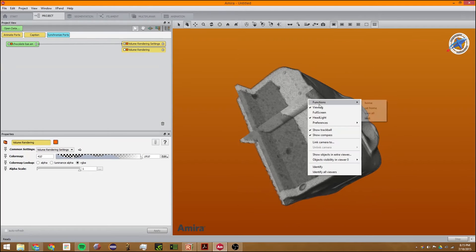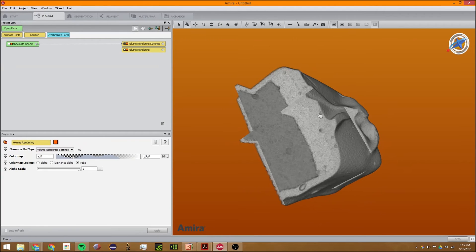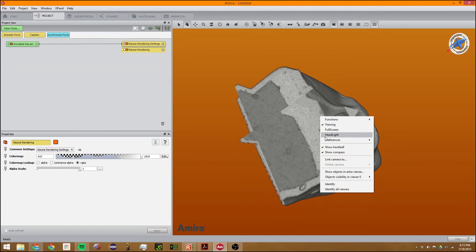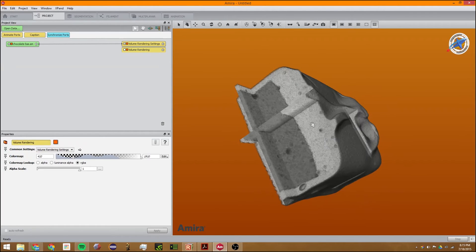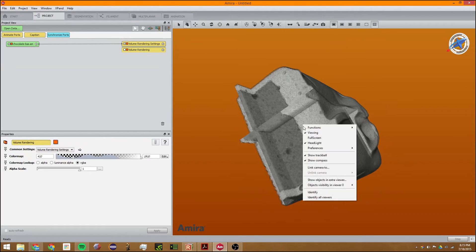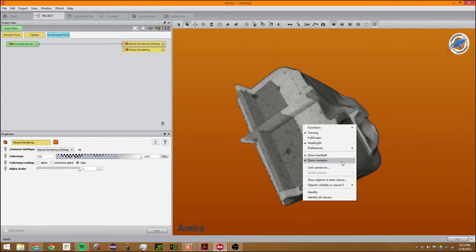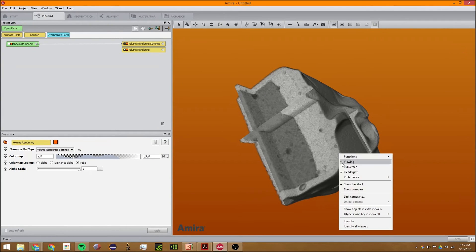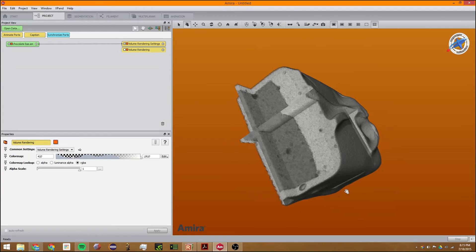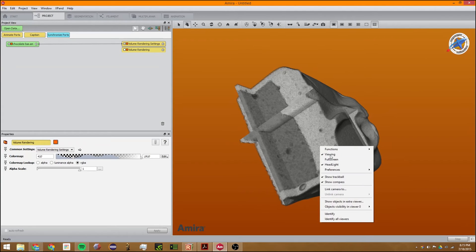You can change the headlight to be on or off, which adds shadows to the build. You can also change the preferences to show the compass. I prefer the compass; it's very nice and shows you where you're looking.